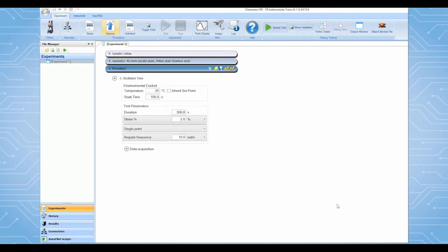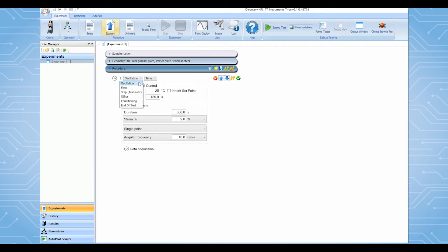In TRIO's, select the Express mode. A frequency sweep test will be used for our first example. From the procedure bar, select oscillation frequency.